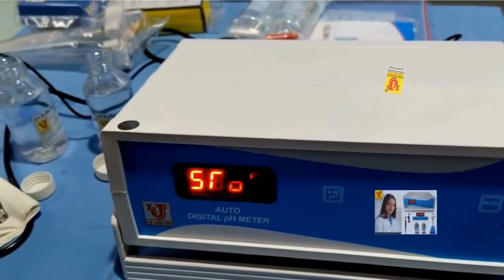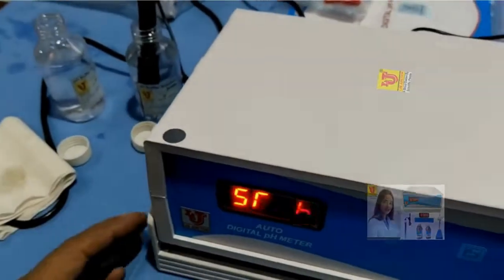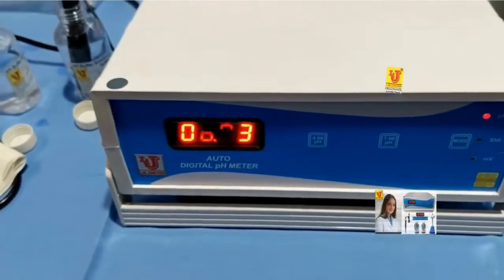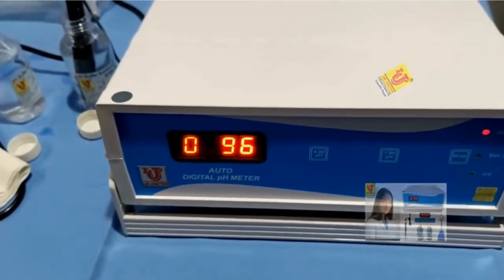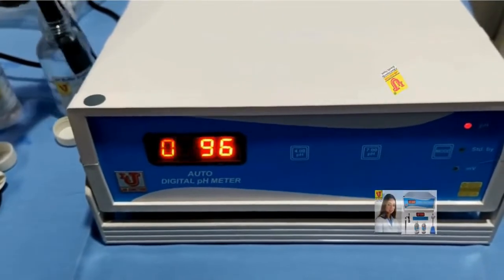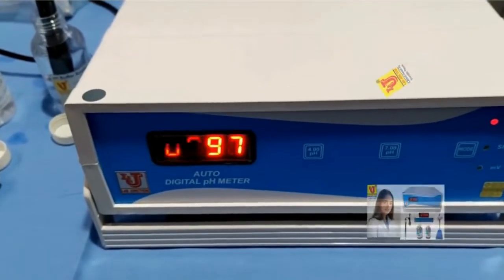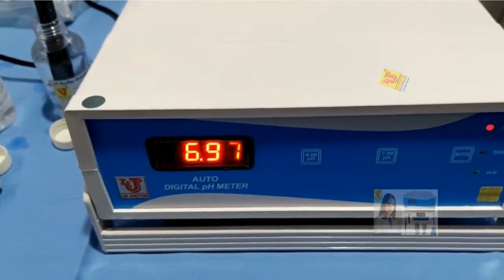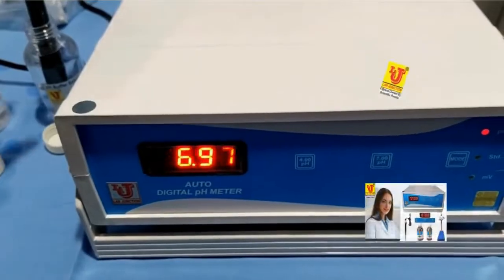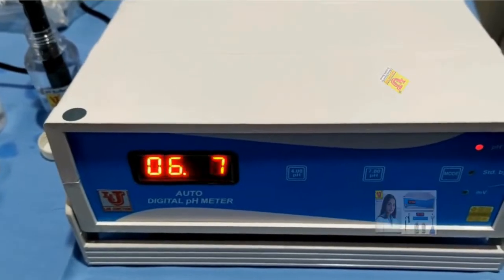Suppose my sample is a pH 7 buffer. Go to pH mode — it directly shows the result of your sample.